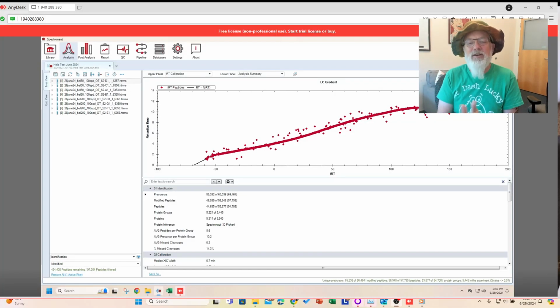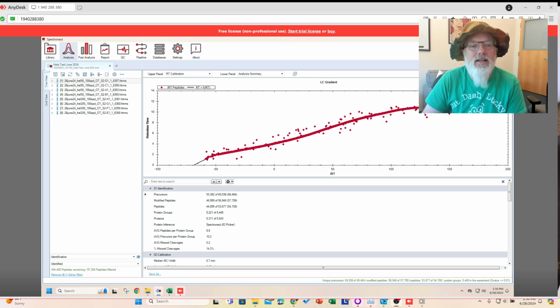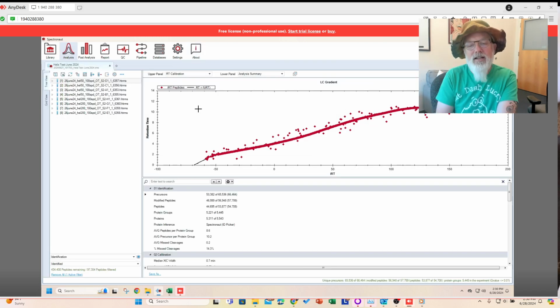Right, hey everybody. I know it's been a while since I made a video, but Spectronaut came out with a new version, Spectronaut 19, I think. They're on 19 point something, I don't know. 19.024, it just came out a couple weeks ago at ASMS, so I thought this would be a good opportunity to look at some of the new features.